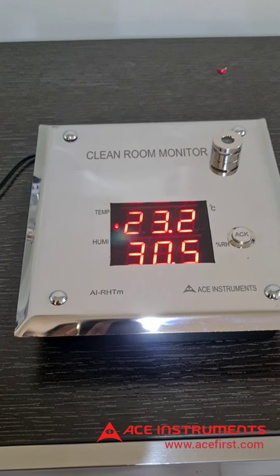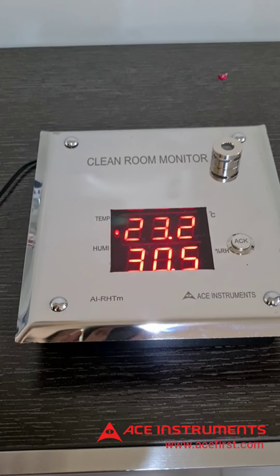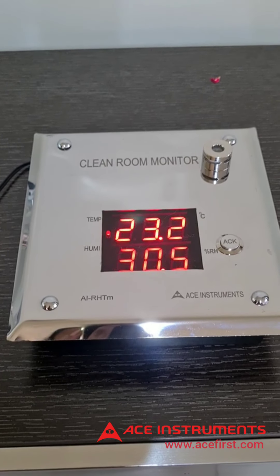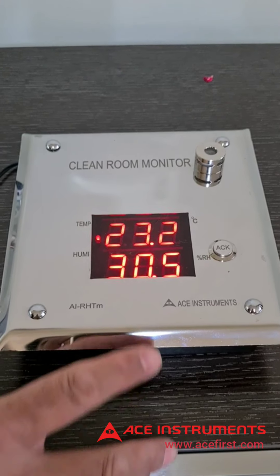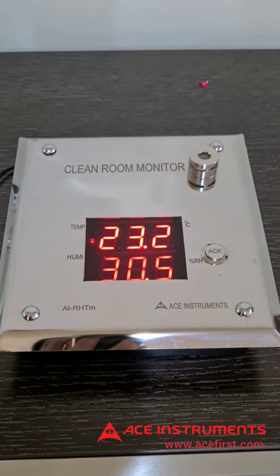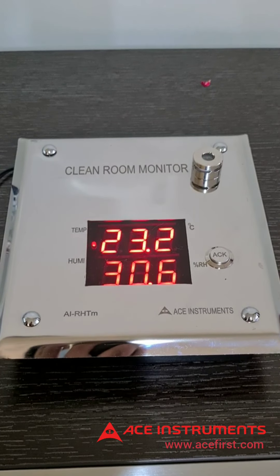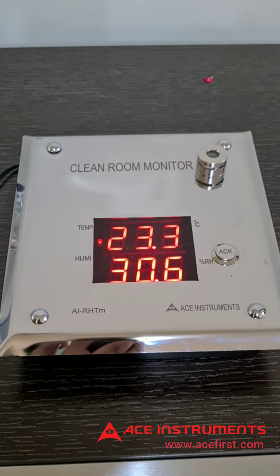Should you not require the buzzer alarm, you can go into the menu using the tactile keys inside and program it such that the buzzer alarm is switched off. There is an acknowledgement key on the front plate which acknowledges or resets the buzzer alarm.